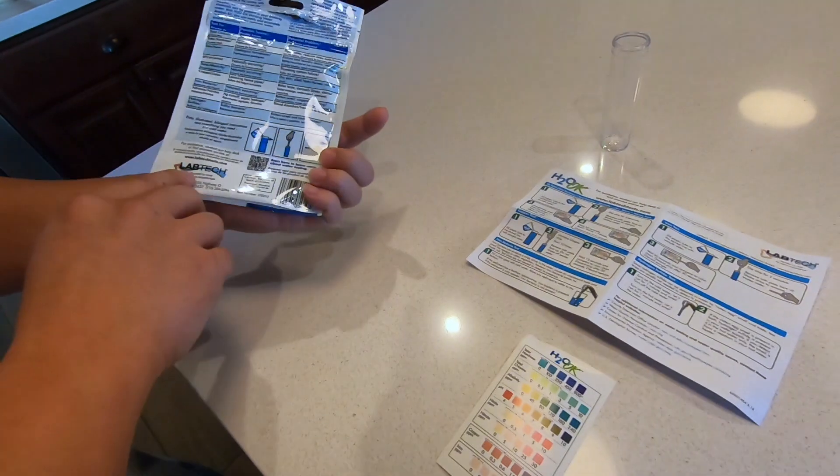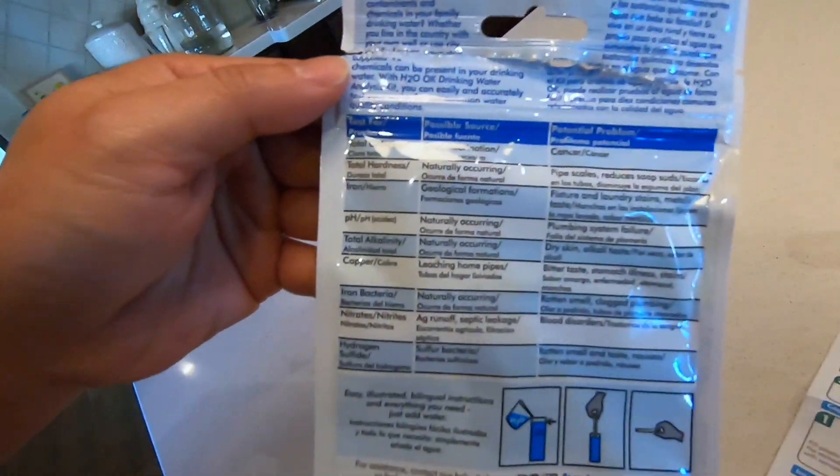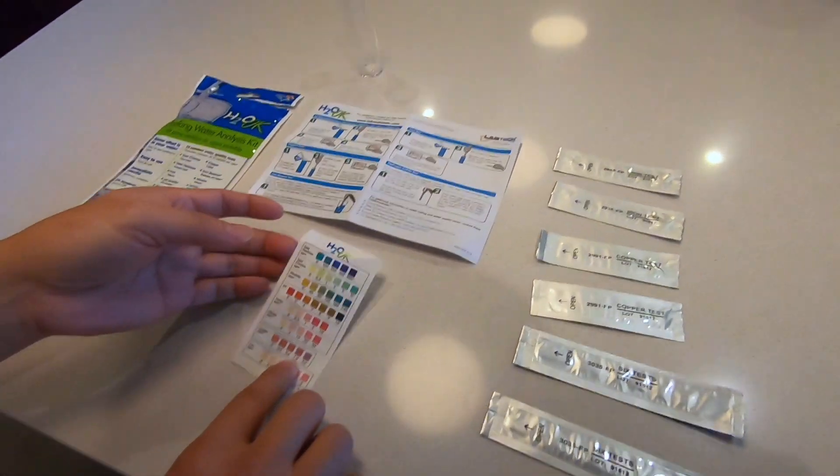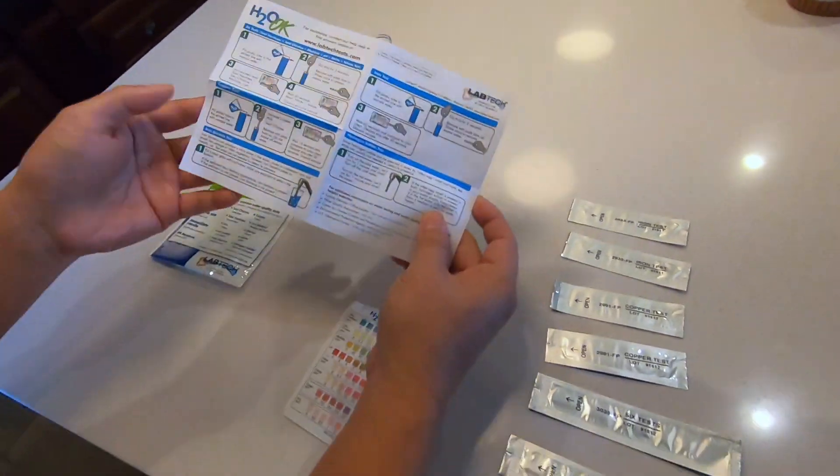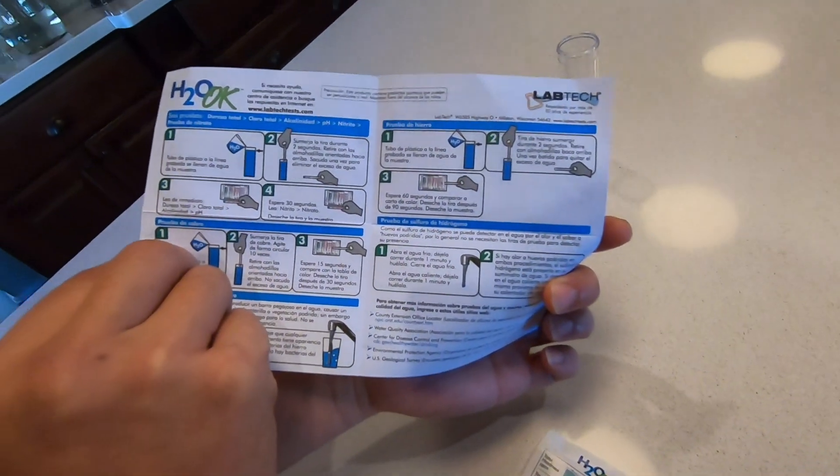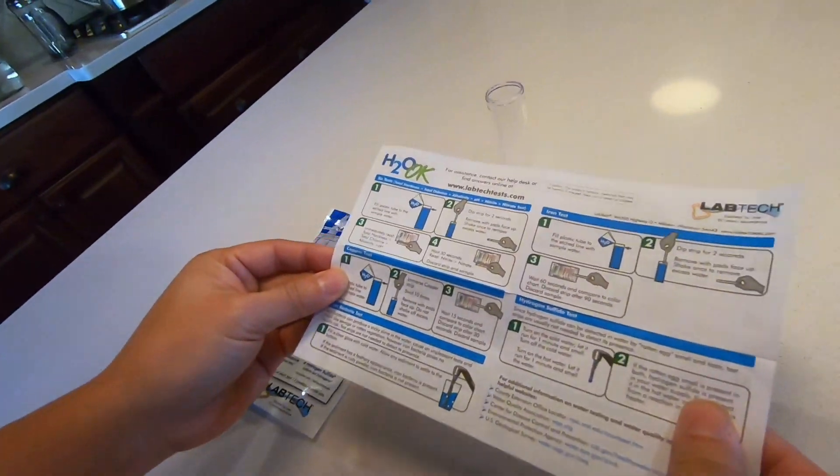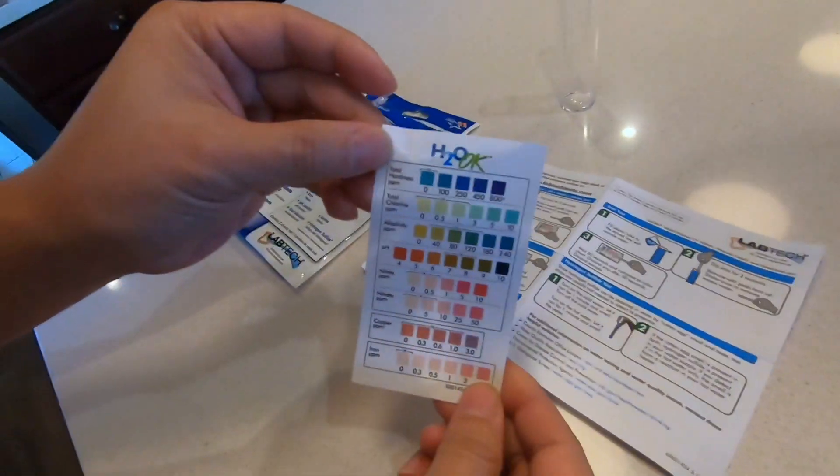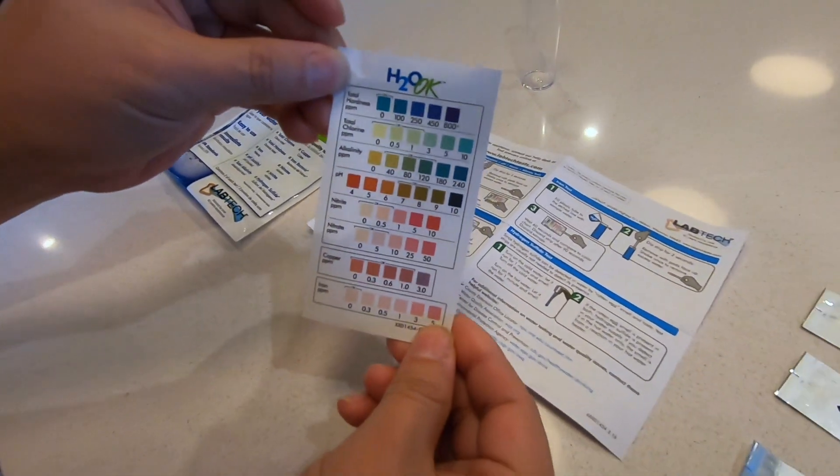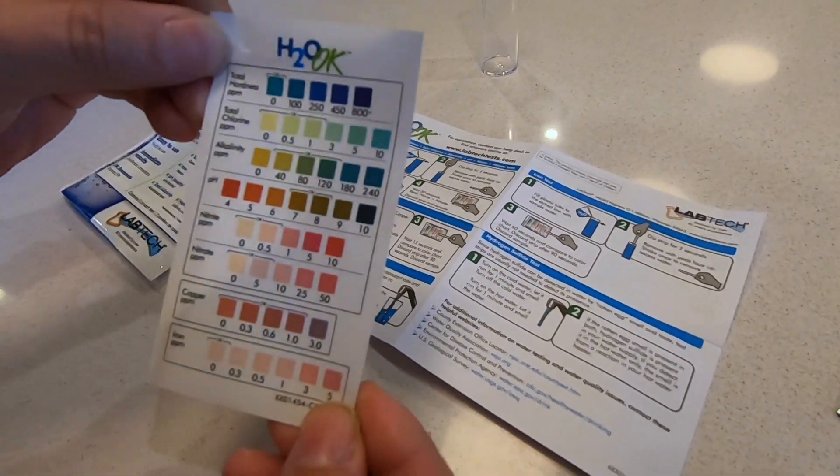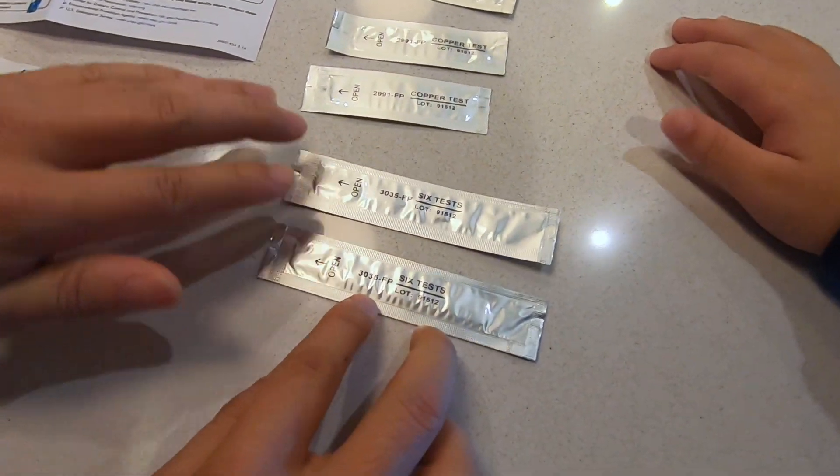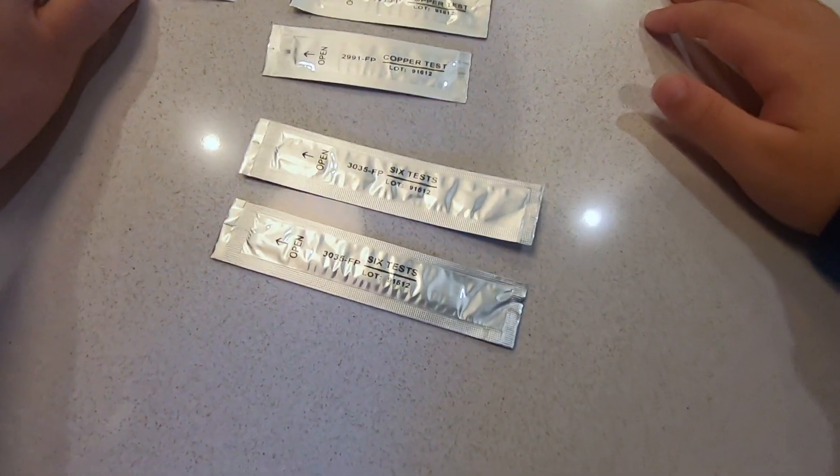So this is what it looks like at the back, and this particular test is everything that we need. It comes with this instruction flyer in English and Spanish. It has this color chart for you to compare with the test strips.